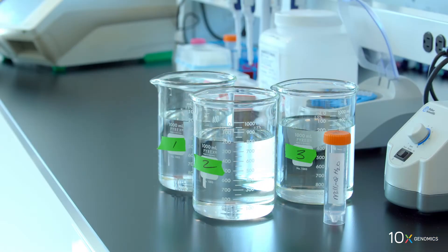We have completed tissue fixation and are now ready to stain the tissue. First, we dispense 50 mils of Millicue water in a 50 mil centrifuge tube for each slide. Then we dispense 800 mils of Millicue water in beakers labeled 1, 2, and 3. The dispense volume in each beaker can be used for two slides.